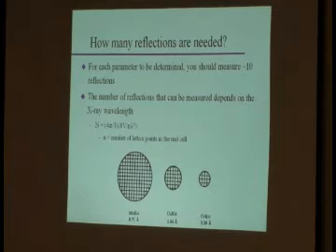If you have other systematic absences, like that 2-1 screw that we did on the exam, they also give you absences. Okay, quite a few of the reflections disappear, but they are not actually accounted for in this equation. So you could have a lot fewer reflections measured than this equation suggests as the maximum number.